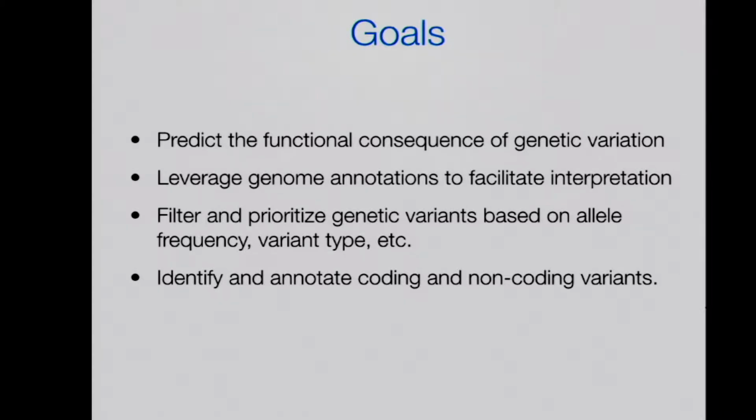genetic variants. And after dinner, we're going to do some detective work and try and solve some genetic disorders in a mother-father-proband trio using some of these methods to try and figure out what is the causal variant underlying these disease phenotypes.